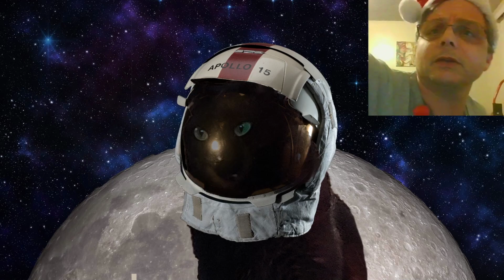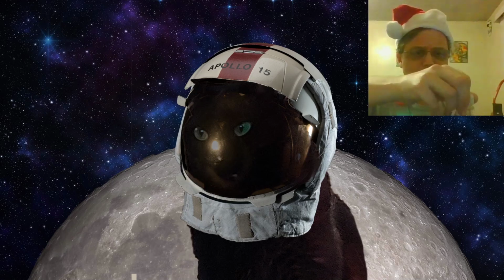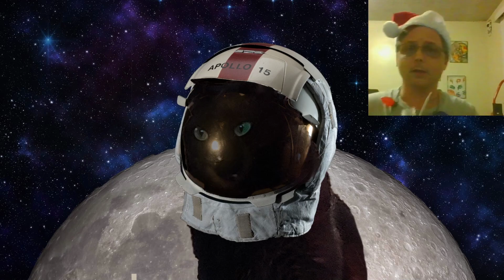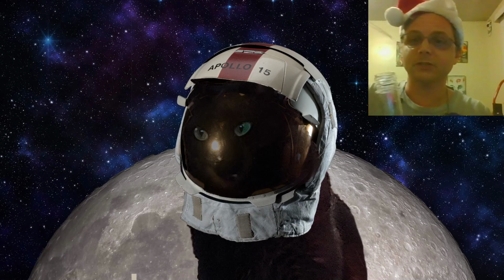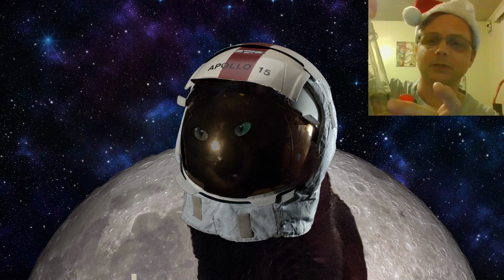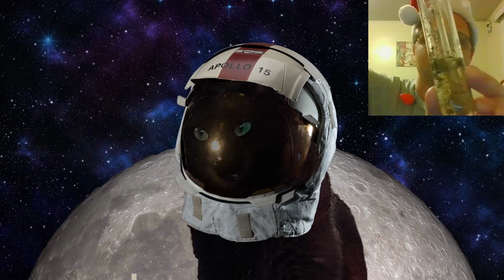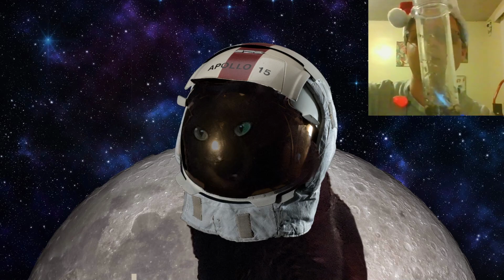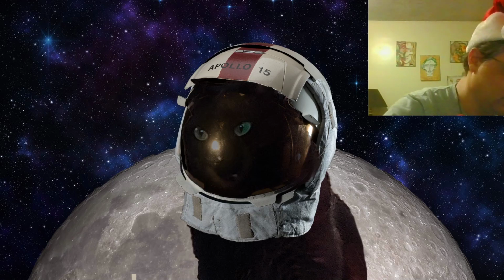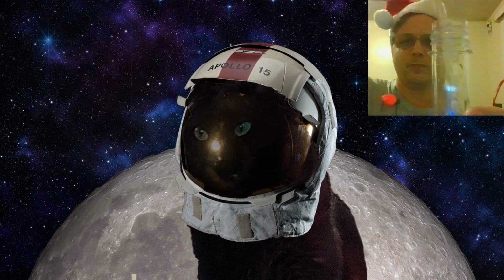Gotta reach behind here and get my sample. Right here, I've got these giant test tubes. Bottoms up. Oh, I'm just kidding. Oh, that's good. I kind of just got it all mixed around in there. Some more solid material. Put onto the slide here. About 5 drops. Put the excess back in it.